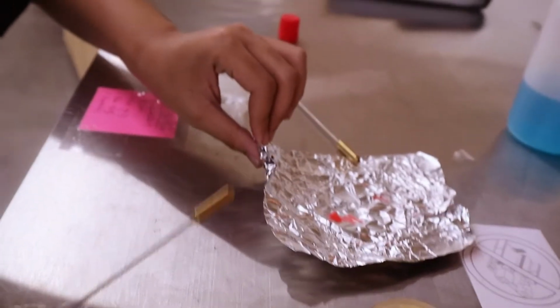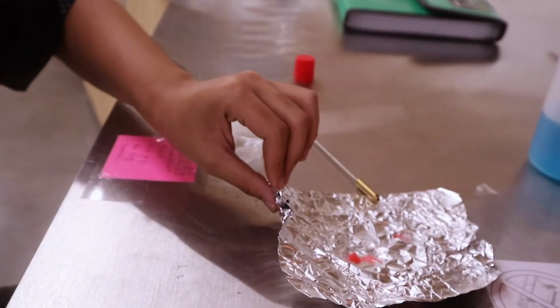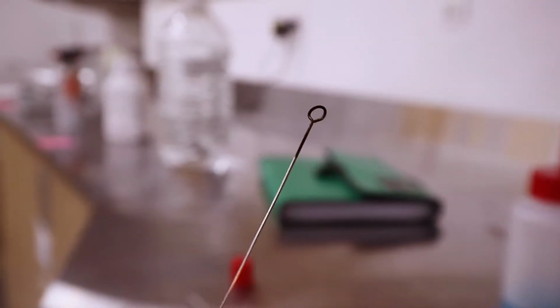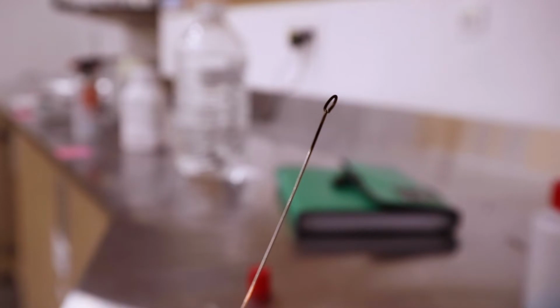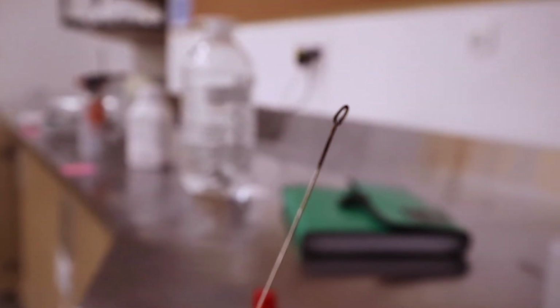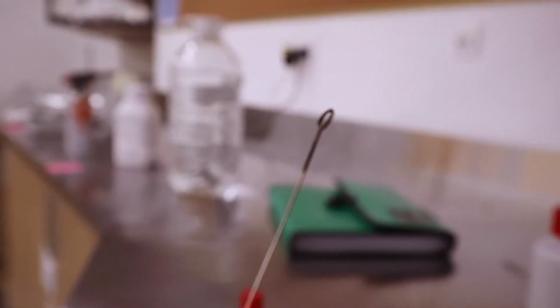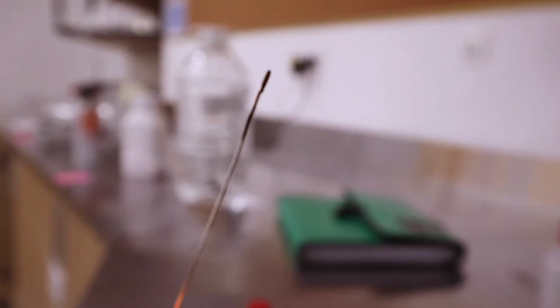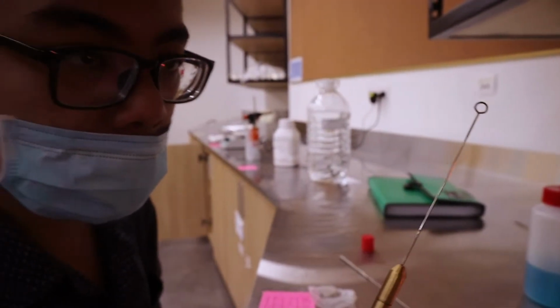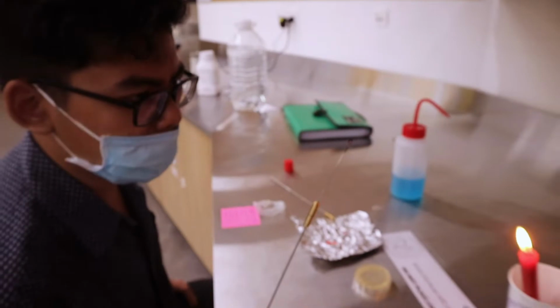Let's do this one more time. Yeah, it's basically sterilized with some coal accumulated on the loop. Because we don't have a Bunsen burner yet, we use a candle as a makeshift heat provider, so we can sterilize this. Perhaps we need to reconsider using a candle, because you can see the black char on this. Doesn't look nice. Maybe it will contaminate the dish.